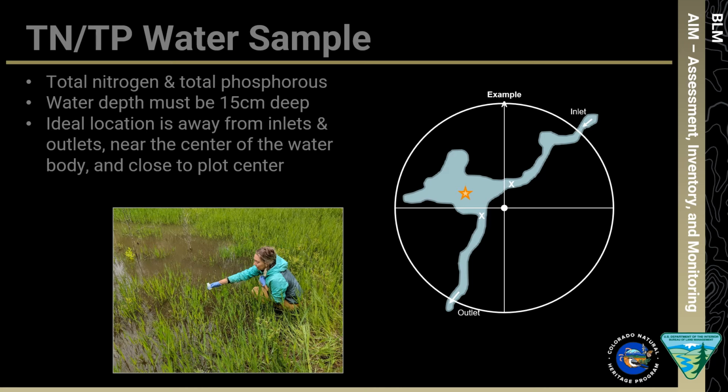Carefully label the sample using a water quality label printed on Write in the Rain paper. Always be sure to use a pencil.